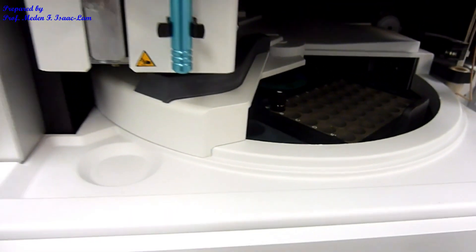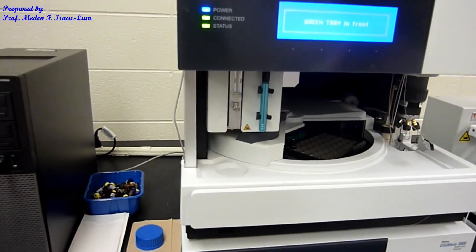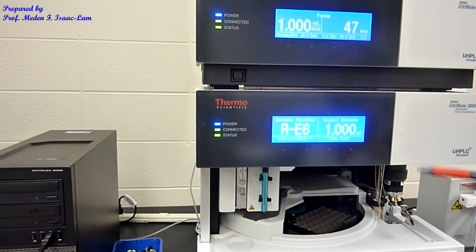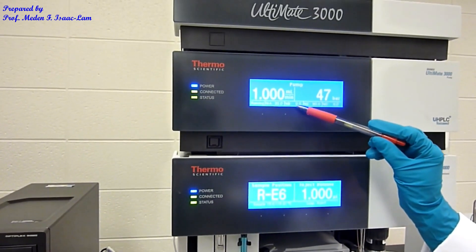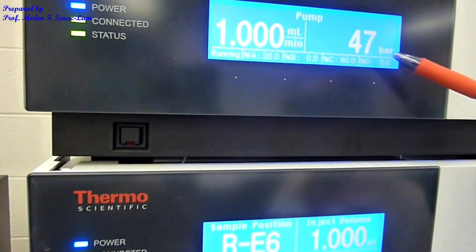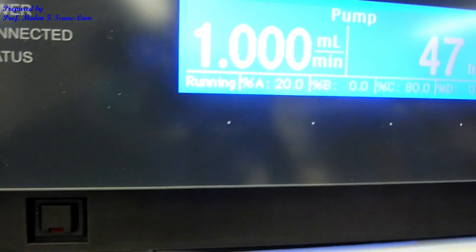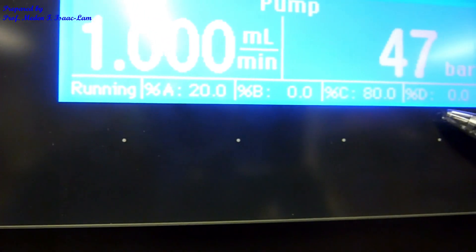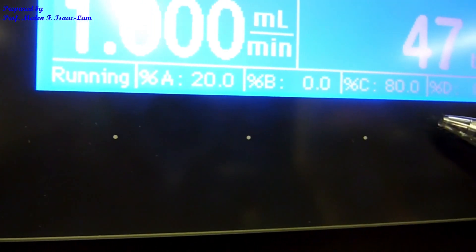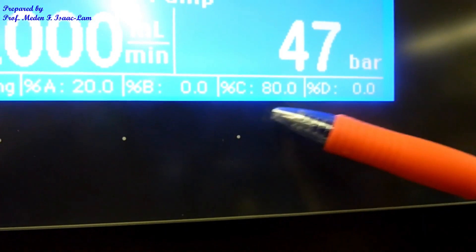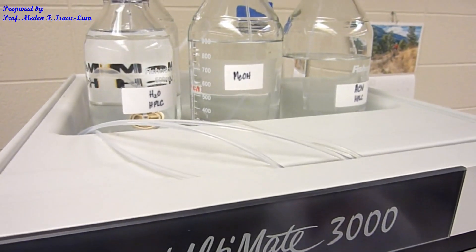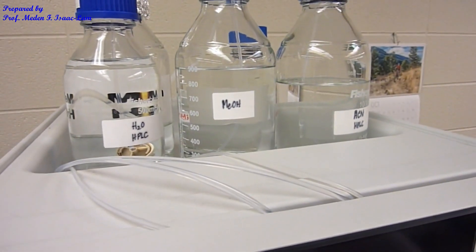The HPLC stands for high-performance liquid chromatography, or high-pressure liquid chromatography. It has a flow rate — I set it at 1 mL per minute — and the pressure is 47 bar. Right now, the combination of solvents is A, B, C, D: A is water, B is methanol, C is acetonitrile. The solvent mixture is 80% acetonitrile and 20% water. For every chromatography, we have a mobile phase and a stationary phase.